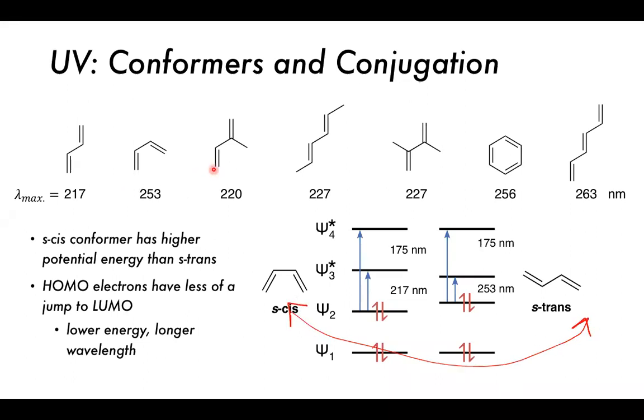Okay. Then here, if we add a methyl group here, we lock in basically the trans, but the methyl group here won't really change the peak position. What it will do is make the absorbance stronger. As we saw earlier, the addition of certain methyl groups can cause epsilon to increase, but it won't really change the peak position of lambda max. The same here, the methyl groups cause a little bit of redshift, but nothing really massively significant.